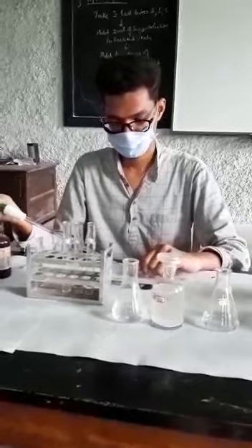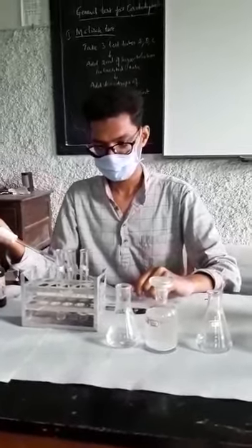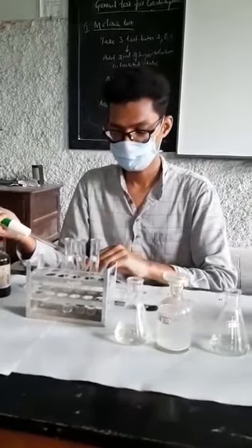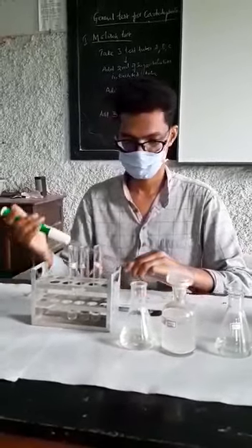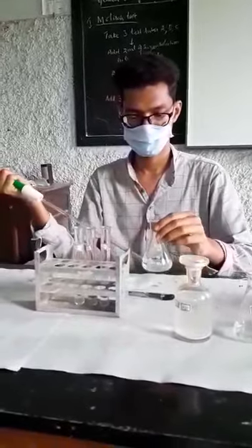Now we will go for the second test for non-reducing sugars, that is starch, a polysaccharide. For this we are taking three different test tubes, and then we will be adding 2 ml of the sample in each test tube. Now Mr. Varun will add samples in all the test tubes.